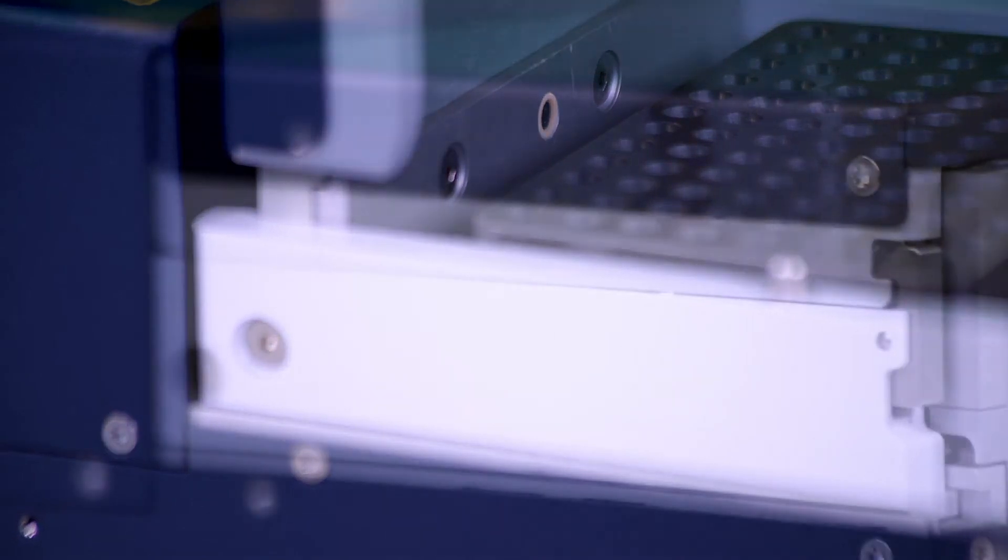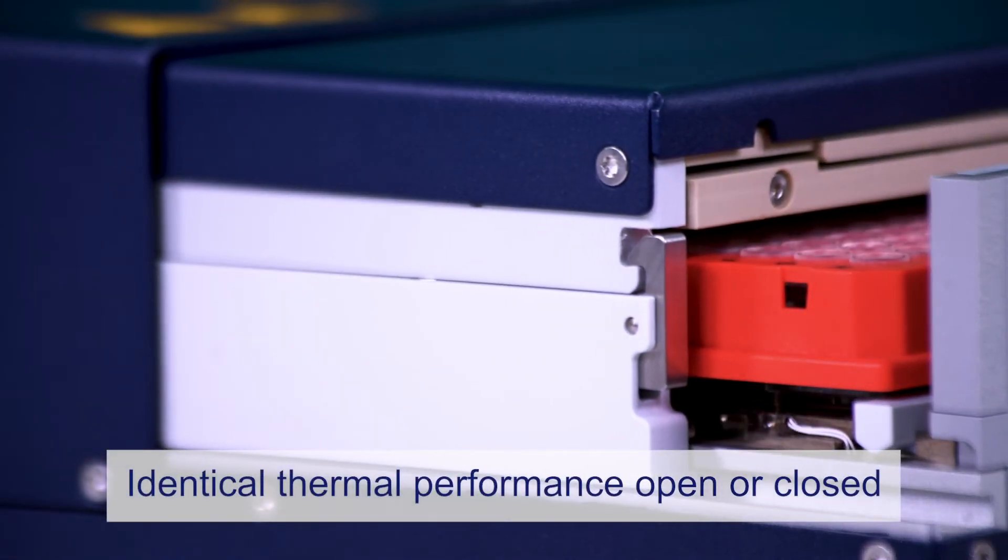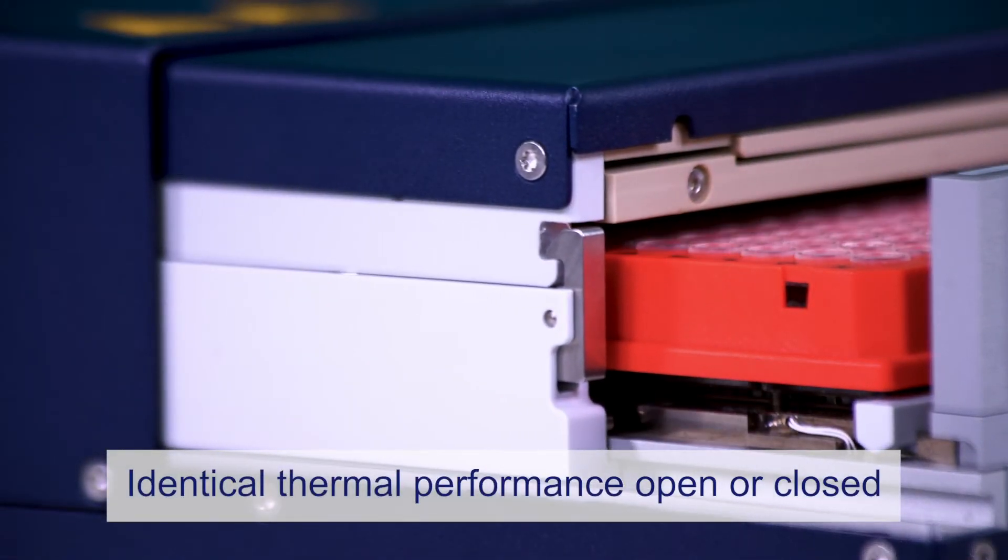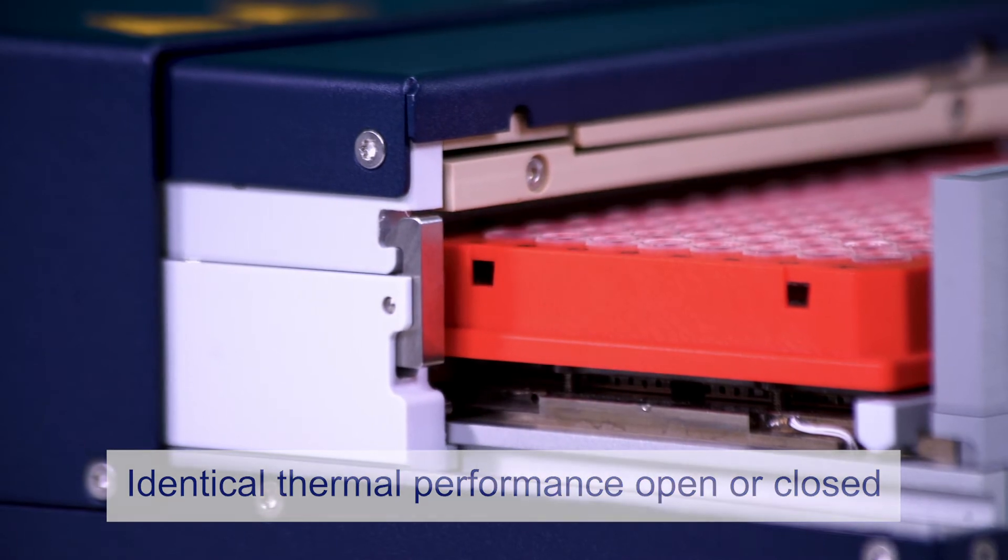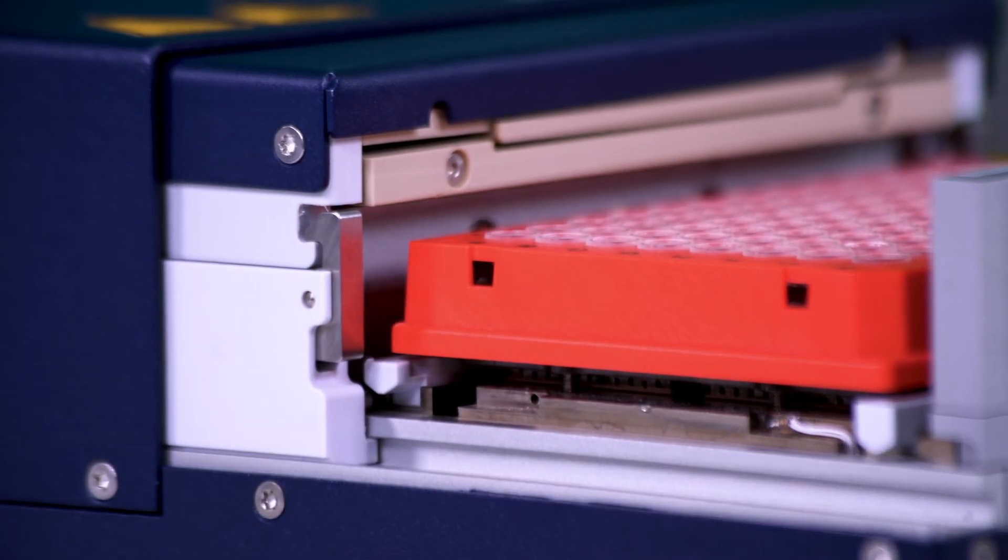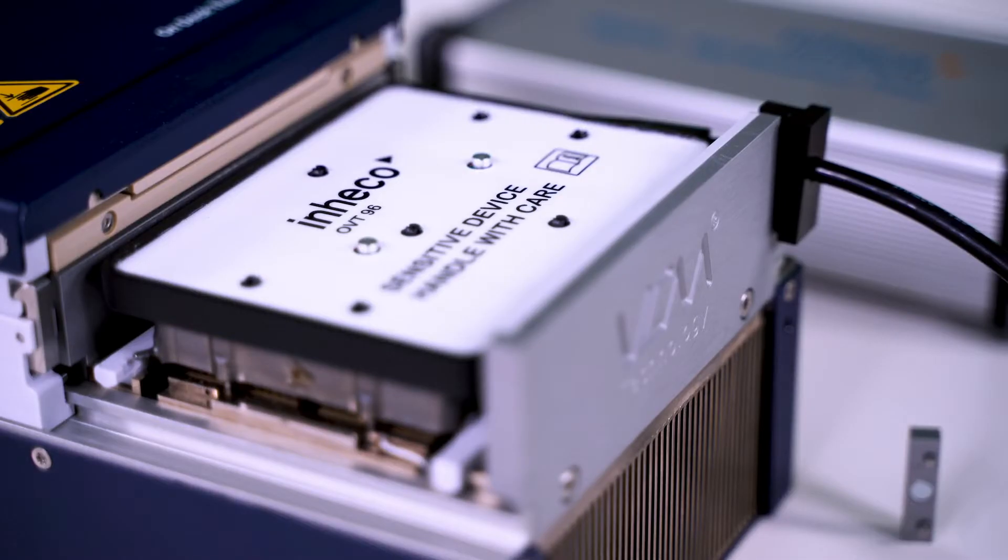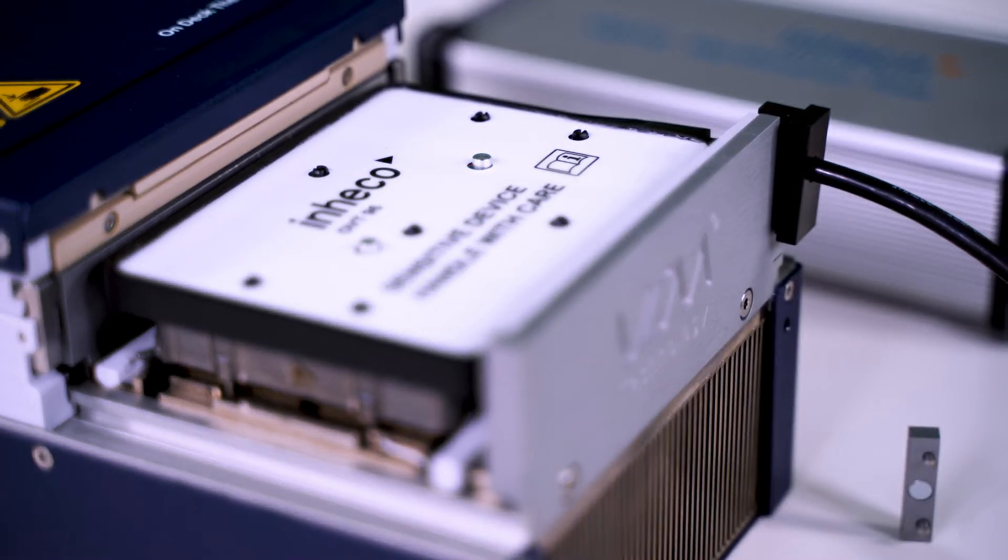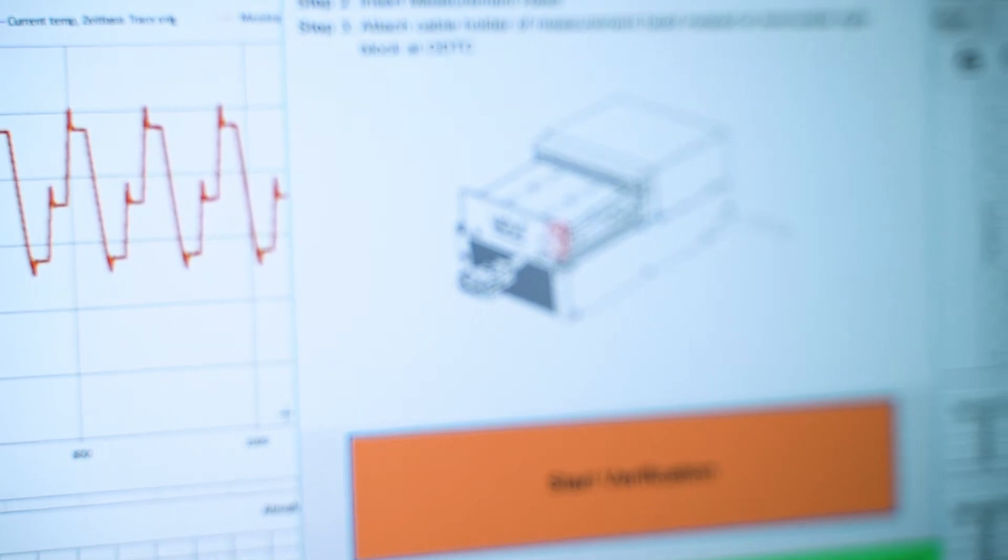Our device offers near identical thermal performance even during open drawer operations such as pipetting. Inheko offers a separate verification tool enabling users to check and verify thermal performance on site.